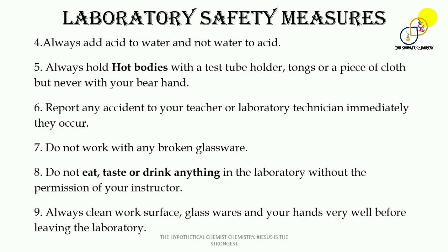Seventh point, do not work with any broken glassware. Eighth point, do not eat, taste, or drink anything in the laboratory without the permission of your instructor. As I said earlier, most of the chemicals there are not edible.